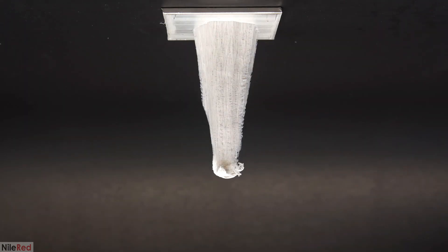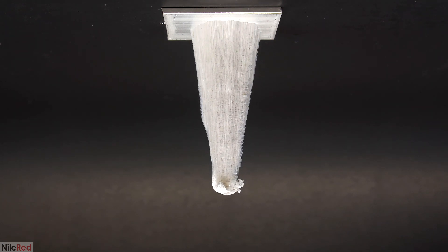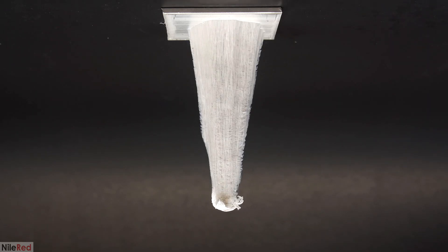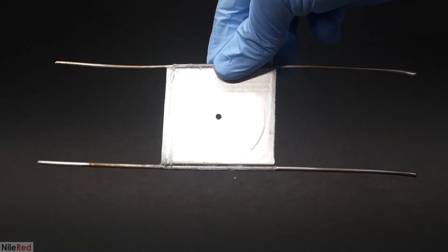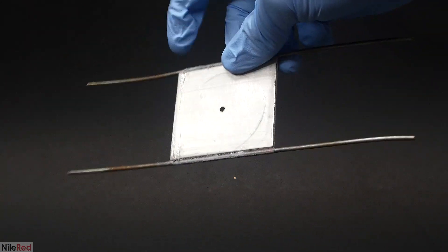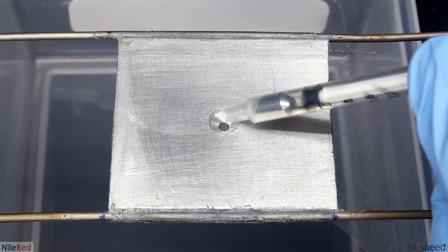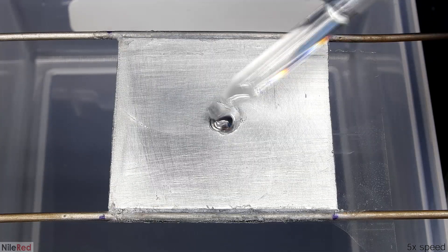This idea of doing things upside down did give me an idea though, and I wondered if it were possible to grow something from both sides of the plate at the same time. To try this out, I cut out another piece of aluminum, but this time I drill a hole all the way to the other side and I glue some pieces of a coat hanger to it.